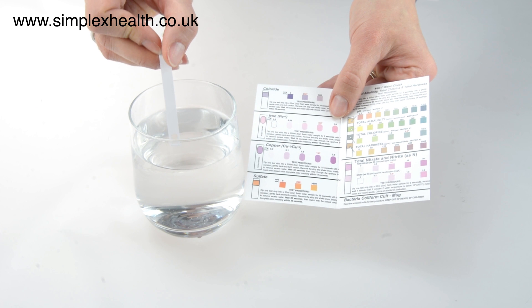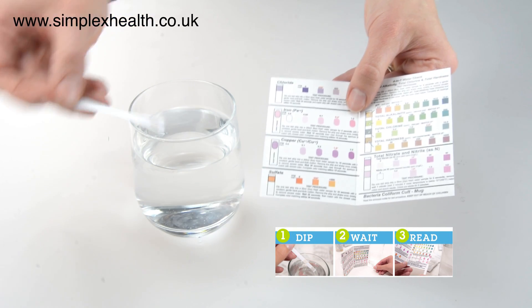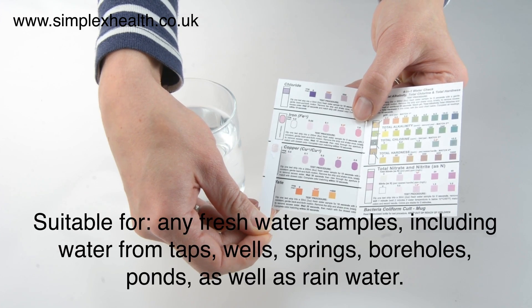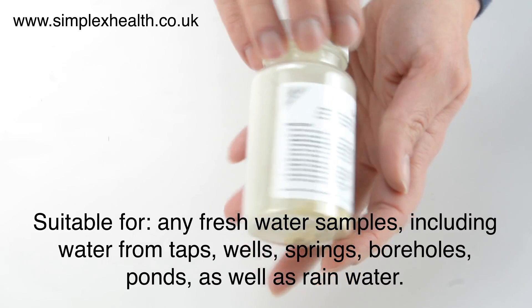The Simplex Health 13-in-1 water test provides results almost instantly with the simple dip, wait, read method. This water test kit is suitable for any fresh water sources including water from taps, wells, springs, boreholes, ponds as well as rainwater.